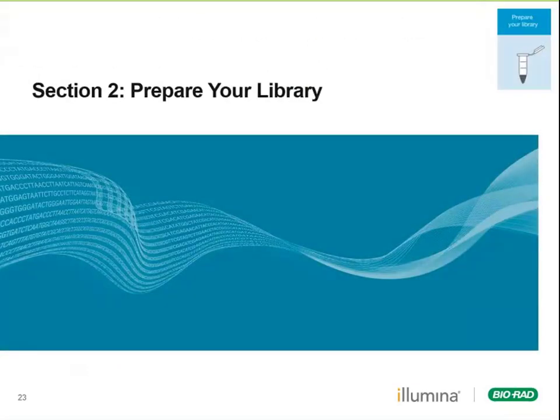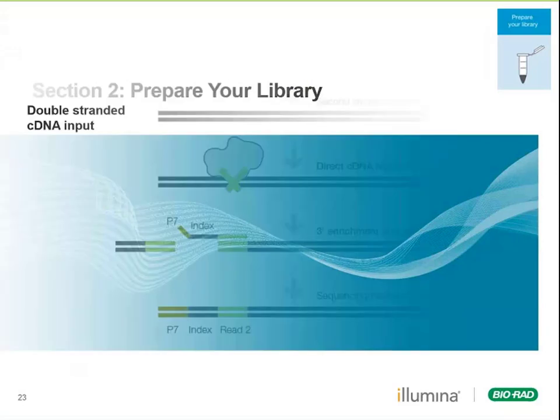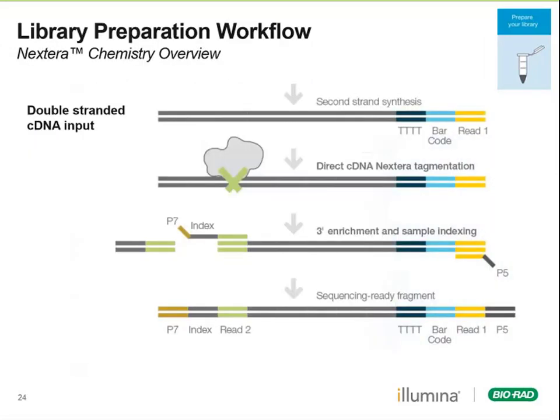Now we're ready for the downstream library prep. This is going to be a modified Nextera workflow. I'm going to do a brief overview today. So we're starting at the top with double-stranded cDNA input.